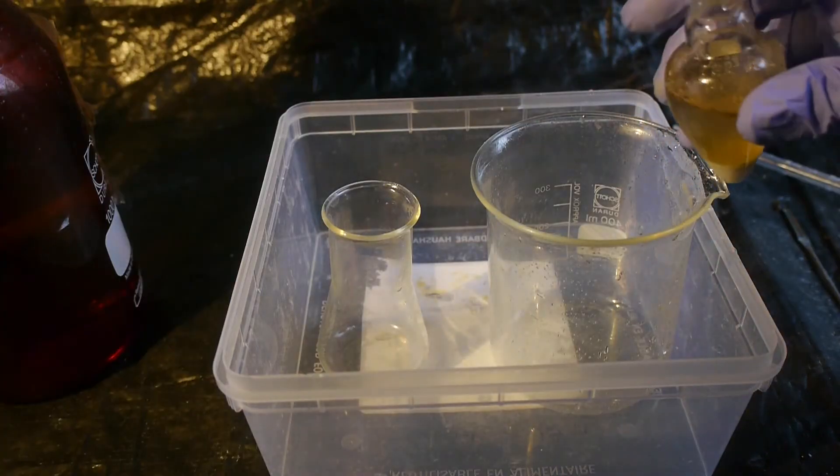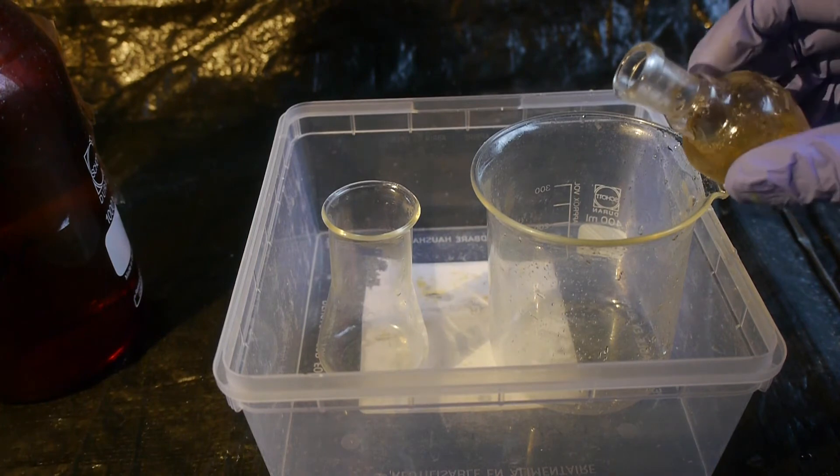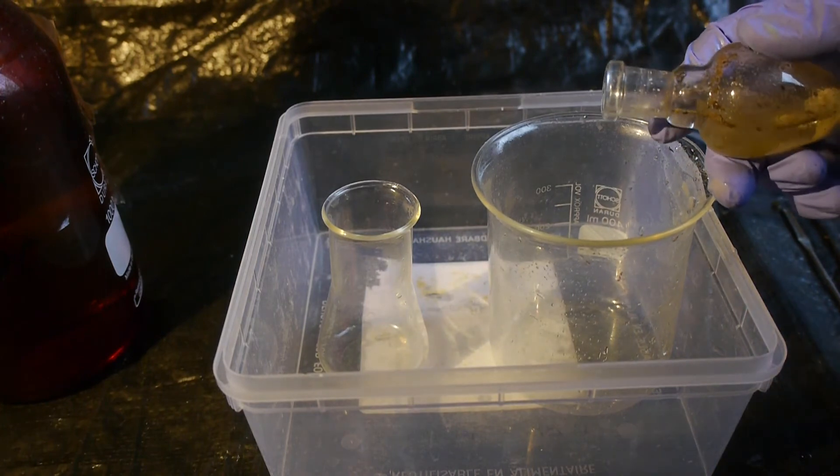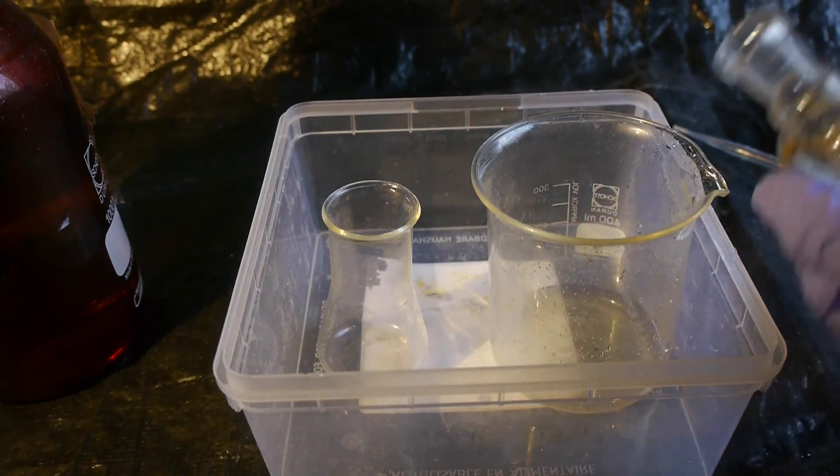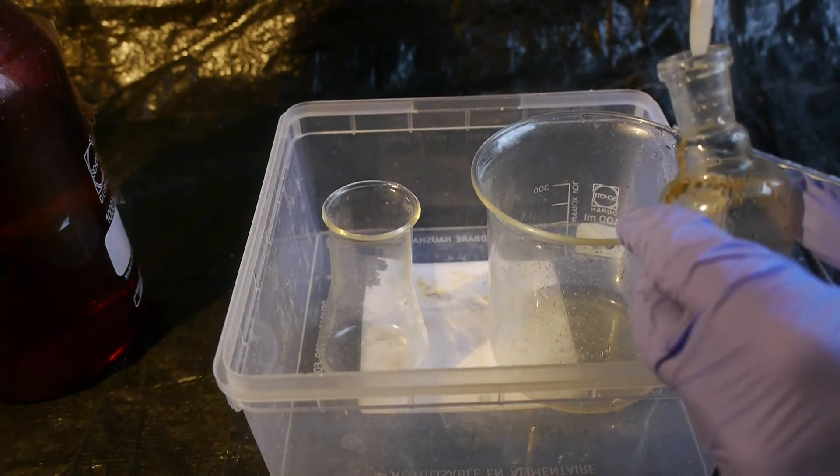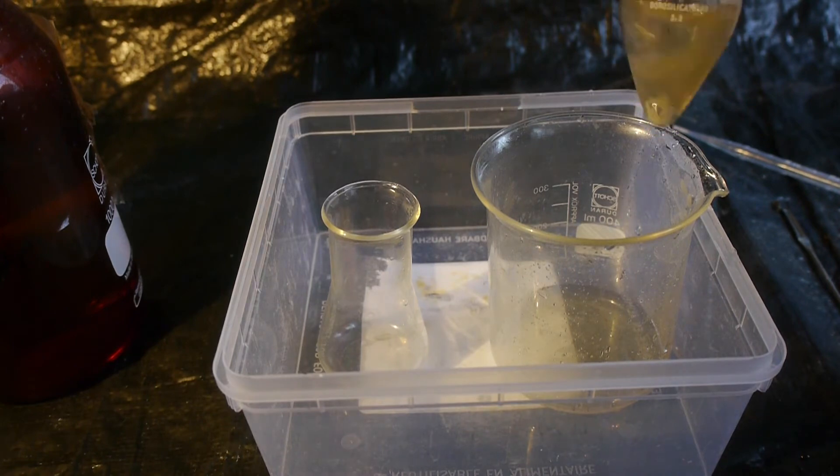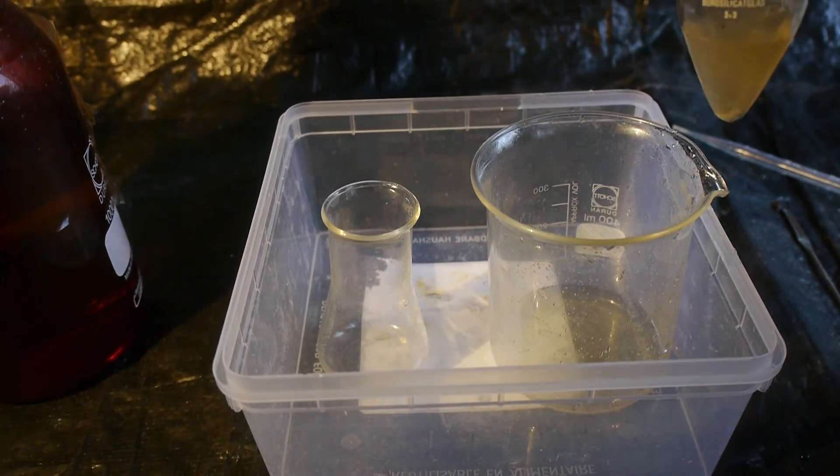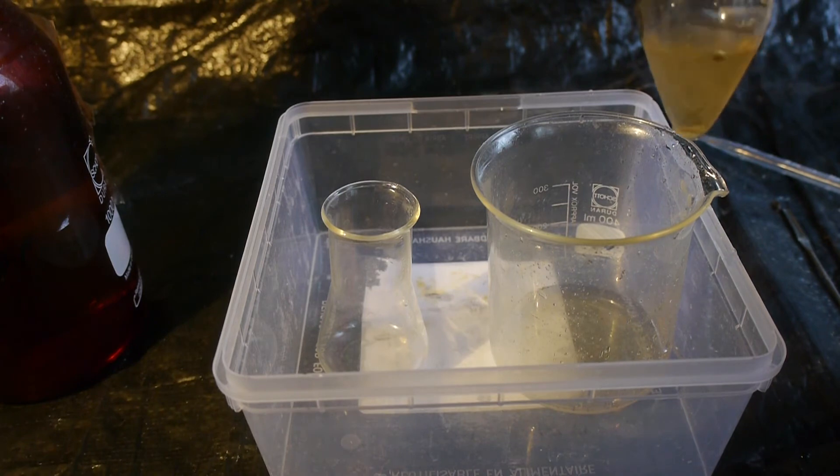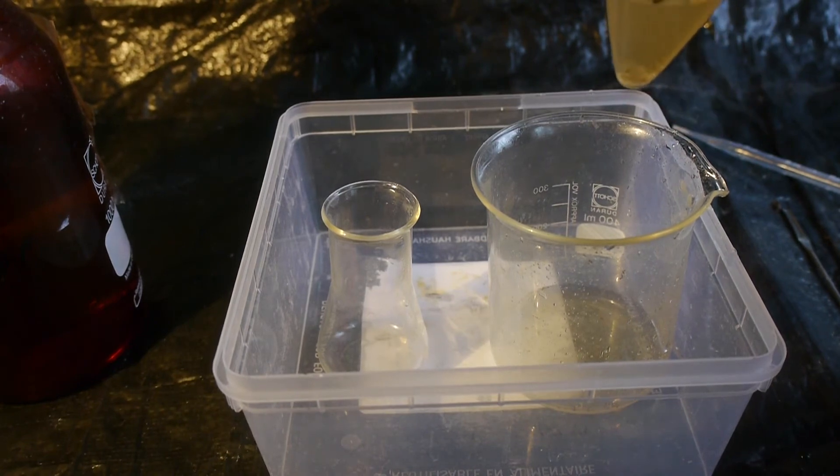And now let's decant off the excess liquid from the gold dust. Or more likely sand. And now I'll have to rinse this like three times with distilled water. Wait. Now most of that stuff seems to have dissolved. Now that's interesting. Maybe that was just precipitated mercury nitrate. Which precipitates when you dilute it.